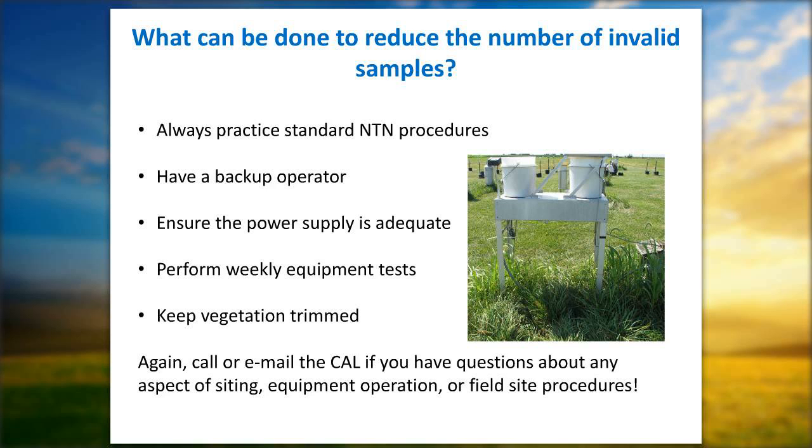It's a new generation of bottle. They're also slightly more flexible. We call them squishy bottles. Those do seem to be helping. We're phasing them into the network as fast as we can and phasing out the old bottles. But in general, yes, the amount of leakage is not increasing and appears to be trending down. So if you have concerns, feel free to call us. One comment too, on your tightening of the bottle: we've had operators in the past who try to put tape around the cap of the bottle.